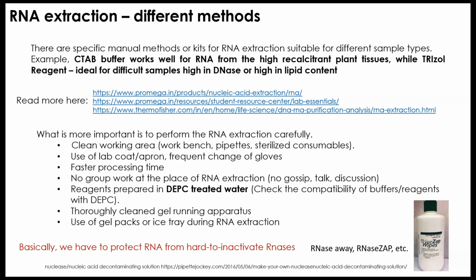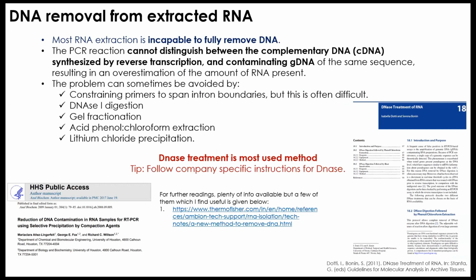However, you can also make RNaseZap or a similar decontaminating solution in the laboratory, for which I have already given you a link. And I don't think it's very difficult to make it. But again, if you are going to buy it, it's going to be a bit expensive. I guess close to 17,000 to 20,000 rupees per liter. And you can make it very easily with not much expensive chemicals in the laboratory, right?